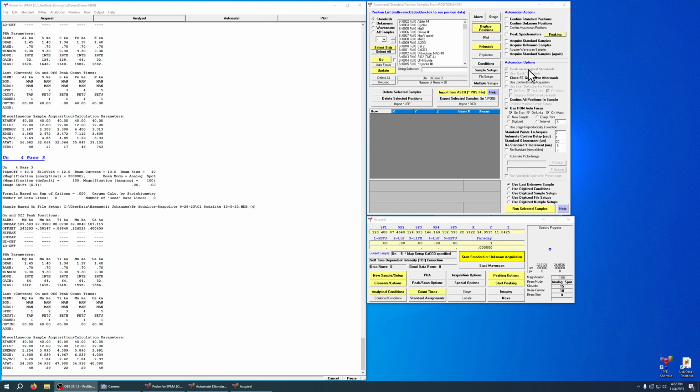So this is the third video in the series on how to use Automate in Probe for EPMA, and here we're going to show you how to actually select samples and run them.